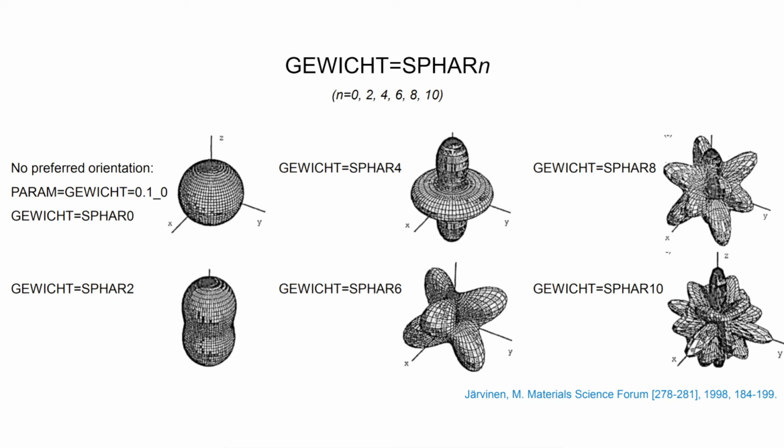So if we have an intensity mismatch for some other reason, for example for chemical substitutions, we could model it with an extremely complex texture model, and then we would have strong correlations between the refinement of substitutions and our texture model, and then we are over processing our data.